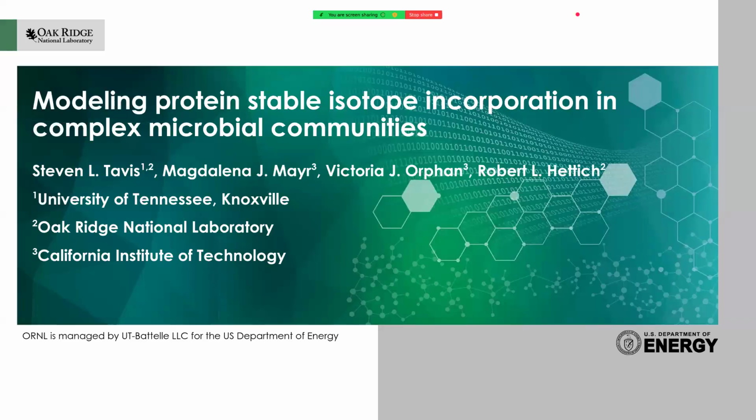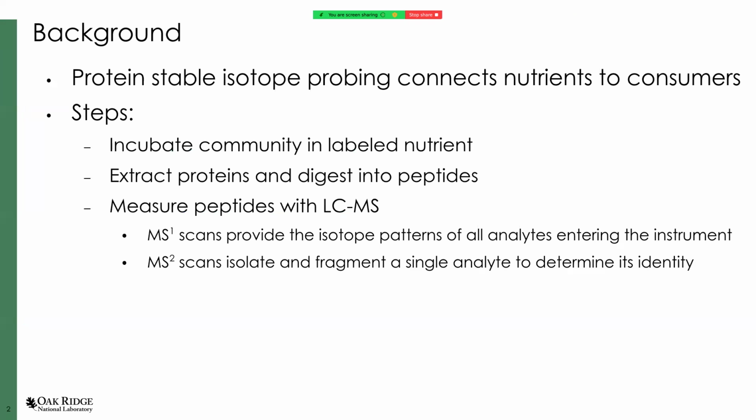Hello, I'm Stephen, and today I'll be presenting modeling protein-stable isotope incorporation in complex microbial communities. Protein-stable isotope probing experiments allow us to connect nutrients to consumers in complex microbial communities.